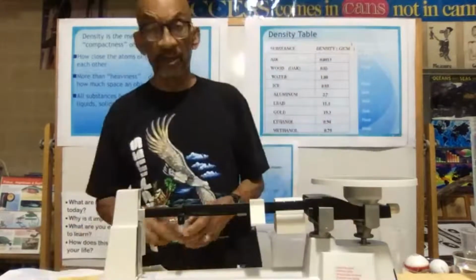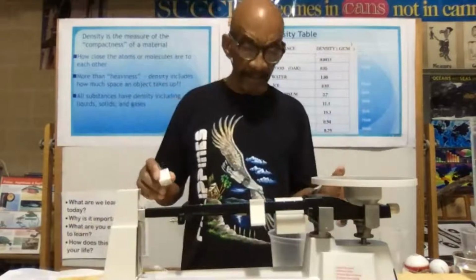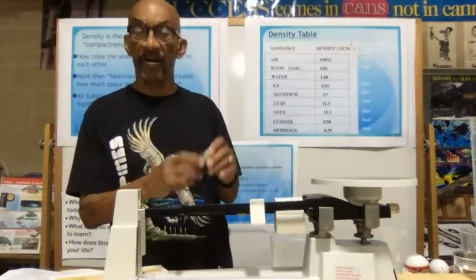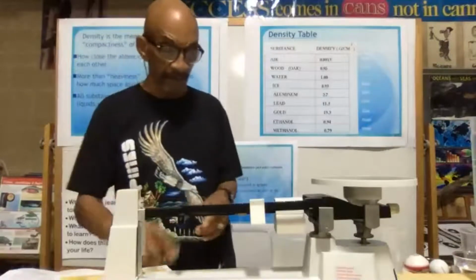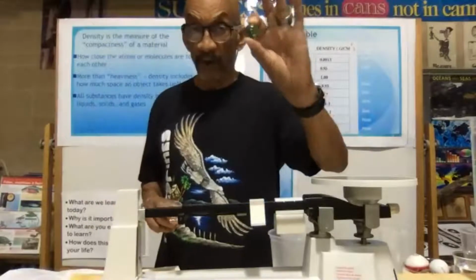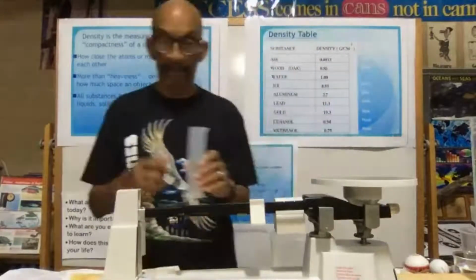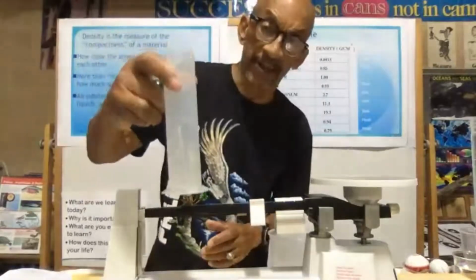Now, if it's an irregular shaped object, of course, you're going to have to do something different, because you're not going to be able to measure the height, the width, or the length. For this example, I took a very large marble, and I'm using a graduated cylinder, which appears like this.